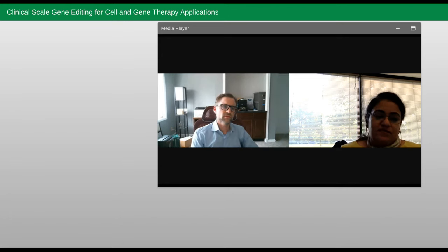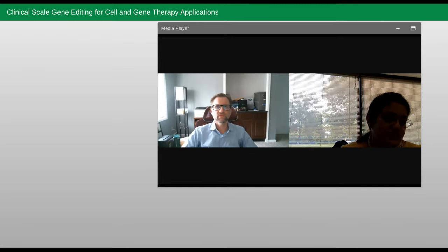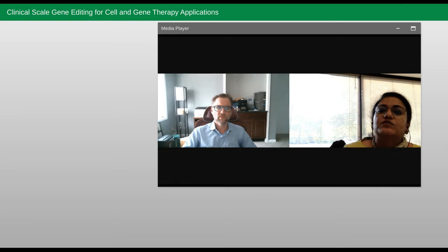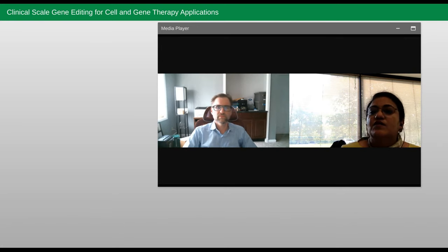Well, I think for obvious reasons. Viral gene editing, first of all, just packaging the gene editing tools into viral vectors is a laborious process. And secondly, viral vectors are known to have insertional mutagenesis, which can be completely avoided with non-viral gene editing. And it's just a lot easier to go through non-viral gene editing because of the editing tools that are available as either RNPs or RNA that we can deliver quite easily through electroporation.